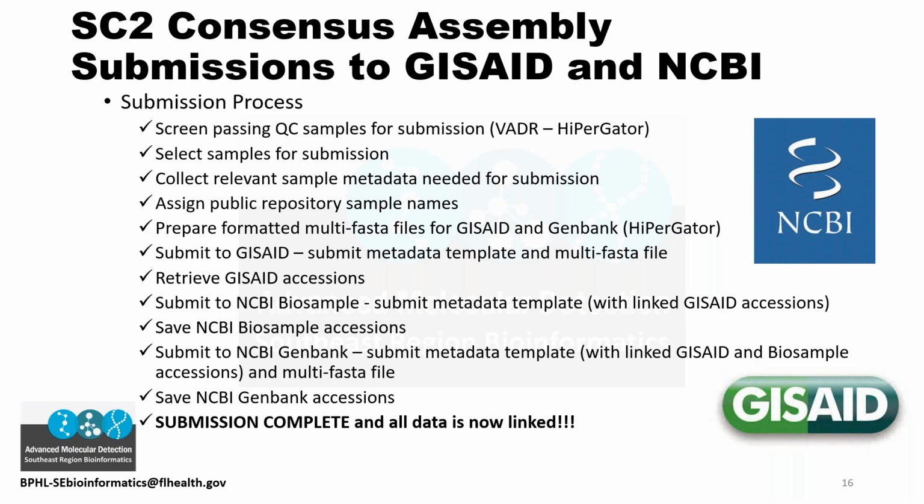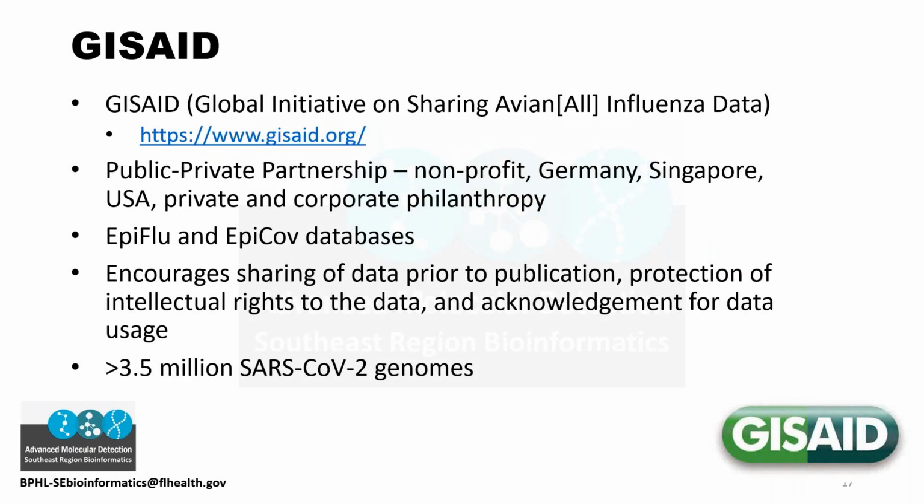That way, at the end, all of your data is linked, so that if someone is trying to look at your data, or you are, you can see, especially on the NCBI GenBank side, that you can link it to your biosample and to the GISAID record. And I'm going to go over biosamples in a little bit more detail in a second.